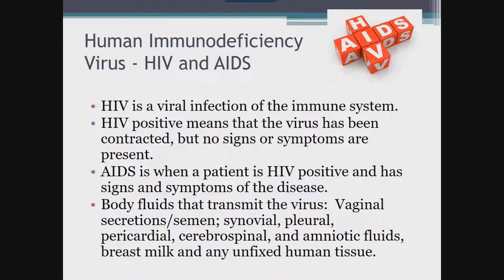HIV is a viral infection of the immune system. Body fluids that transmit the virus include vaginal secretions and semen, synovial, pleural, pericardial, and cerebral spinal fluid, amniotic fluid, breast milk, and any unfixed human tissue. Patients diagnosed with HIV have two diagnoses depending on extent: HIV positive means the virus has been contracted but no signs or symptoms are present; AIDS, or acquired immunodeficiency syndrome, is when a patient is HIV positive and has signs and symptoms of the disease. Exposure to HIV in the laboratory can occur at any point during the processing and handling of specimens.